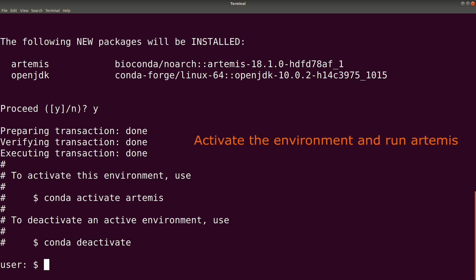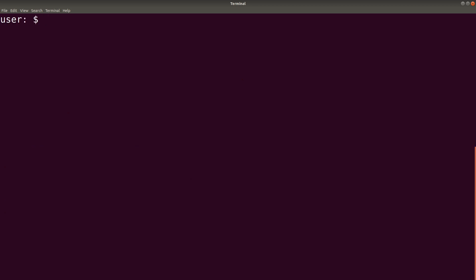So now that we are done with the installation, what we need to do to run Artemis is to first activate the Conda environment. And you do that using this command. Let's clear the screen first. So we say conda activate artemis. So this will activate Artemis for us.